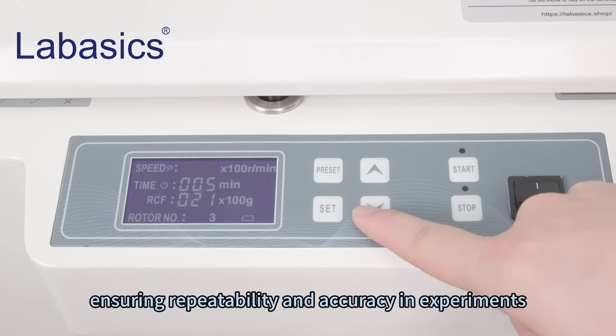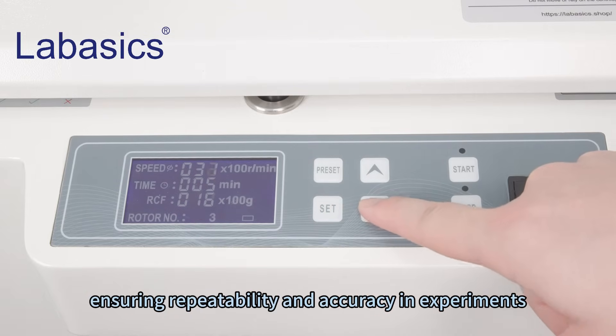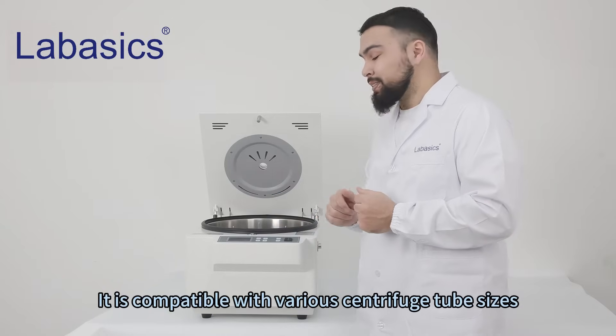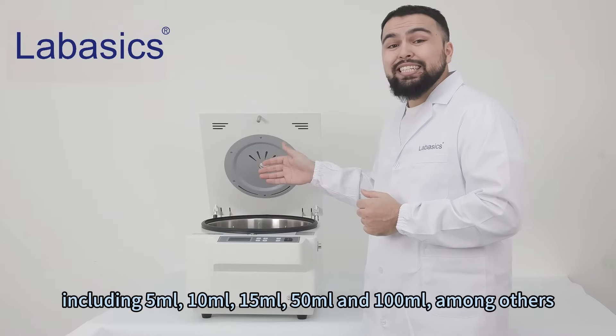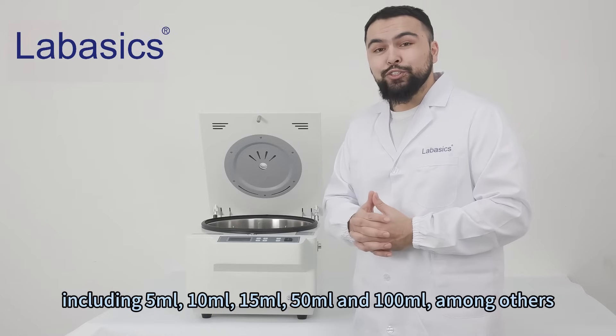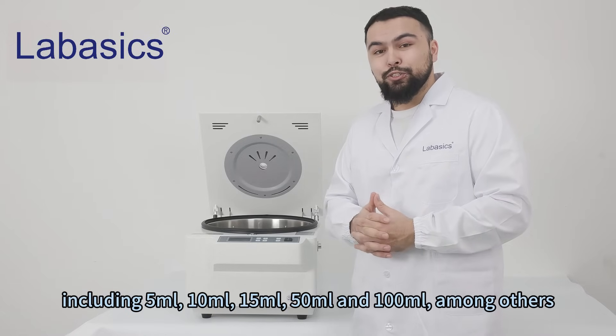Ensuring repeatability and accuracy in experiments, it is compatible with a variety of centrifugal tube sizes, including 5 milliliters, 10 milliliters, 15 milliliters, 50 milliliters, and 100 milliliters, among others.